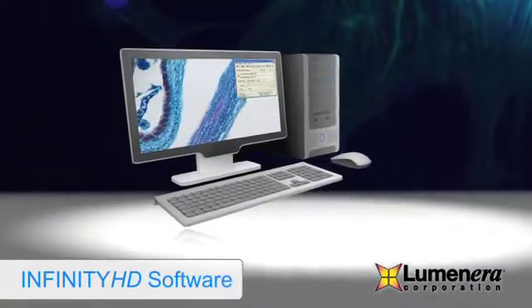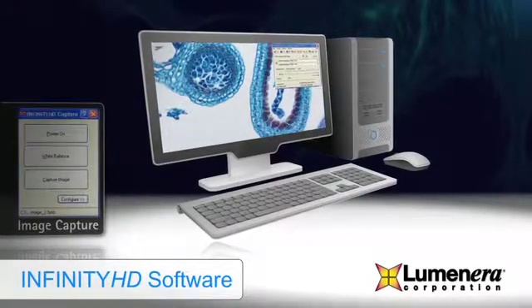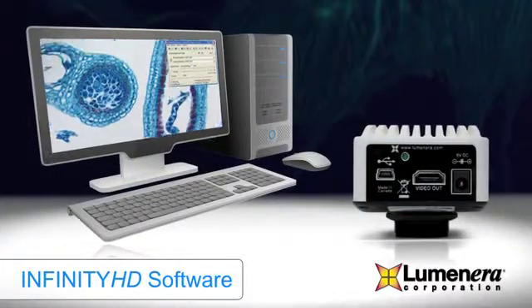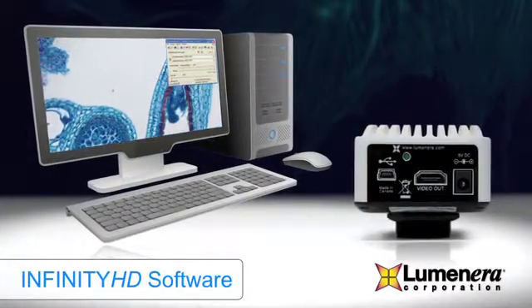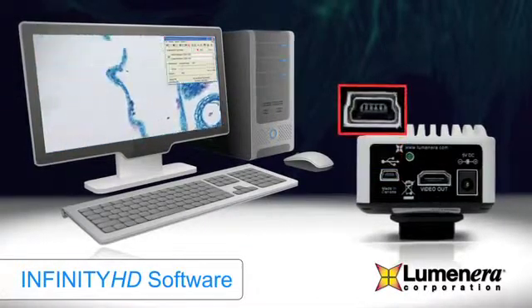This complete solution includes Infinity HD software that allows for image capture. The software is intuitive and can be set up in minutes. Once the camera is initially installed, the camera runs independently without the need for a computer. Image capture is achieved via the high-speed USB 2.0 connection.